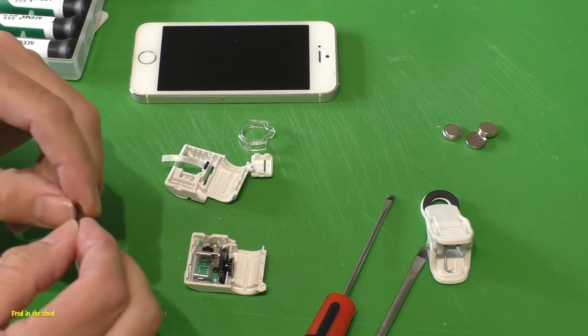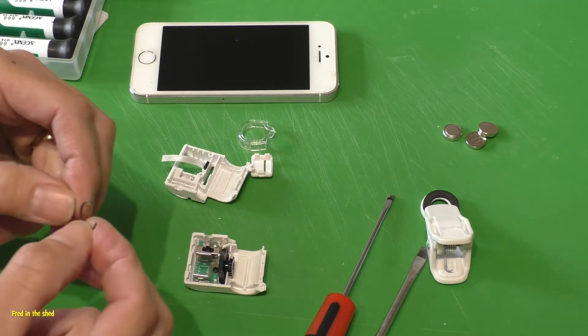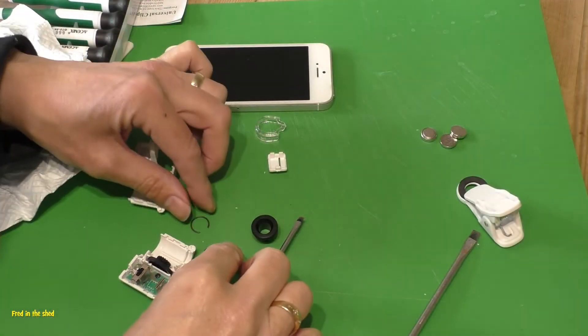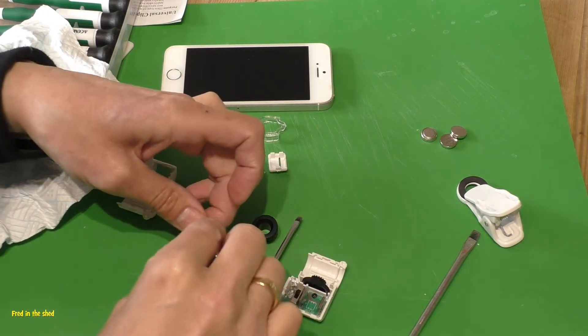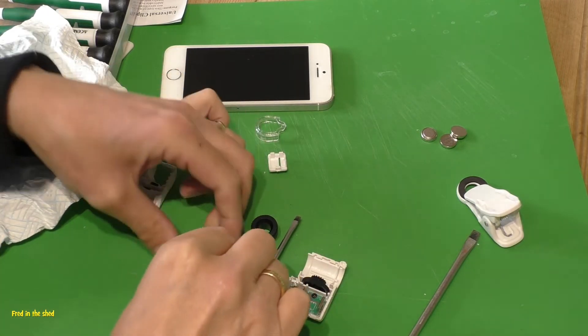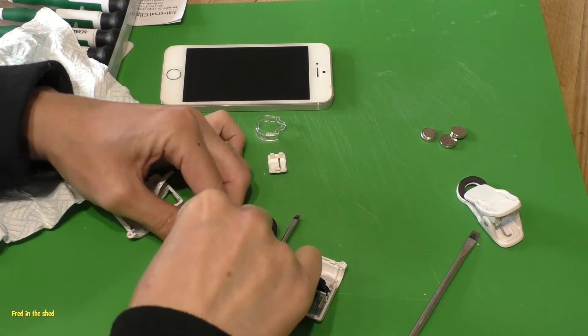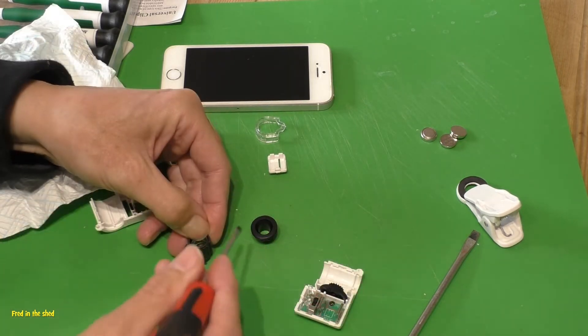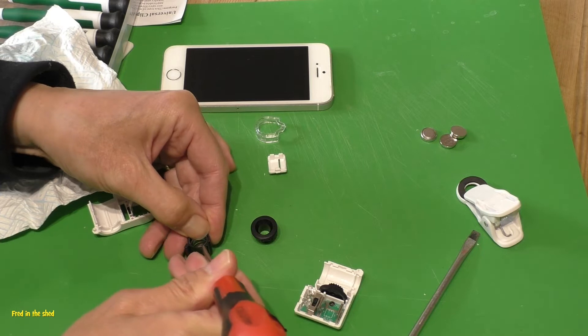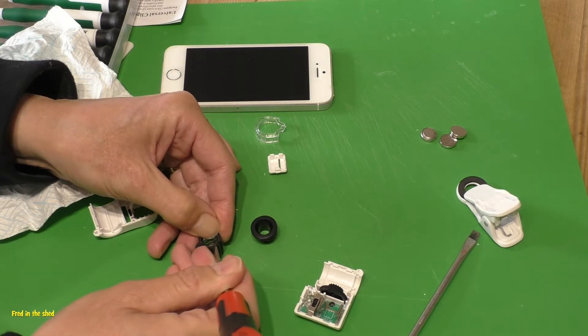It was obviously holding the lens element in the focusing tube. I'm guessing that being shipped over from China, it got dropped and knocked about, and it had sort of fallen out. I tried to put it back in, but there's nothing really to hold it in - once you pushed it into the tube, it just kind of fell out again.